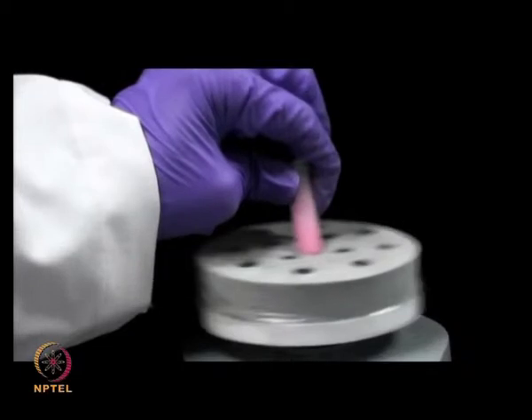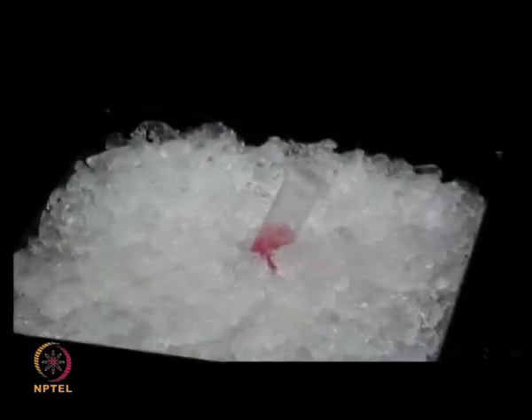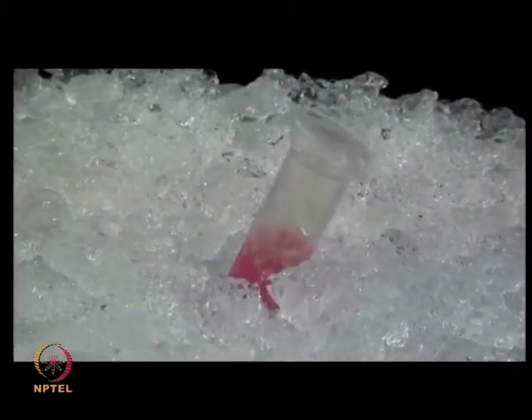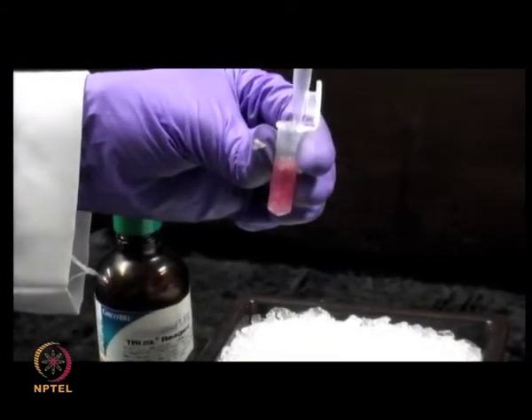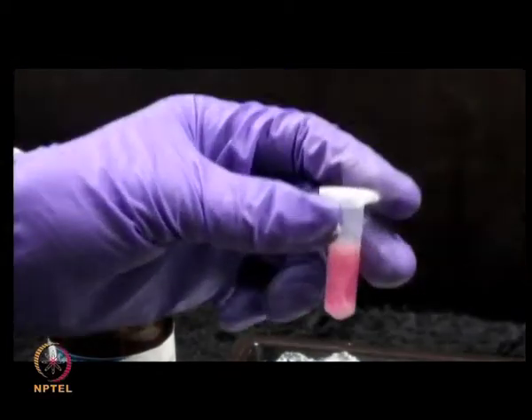Mix the contents thoroughly by vortexing. Next, add chloroform to this solution, mix the contents and place the tube on ice for a few minutes.